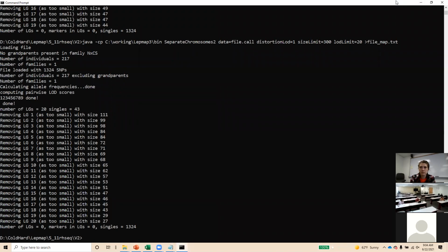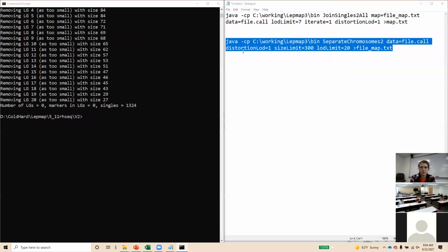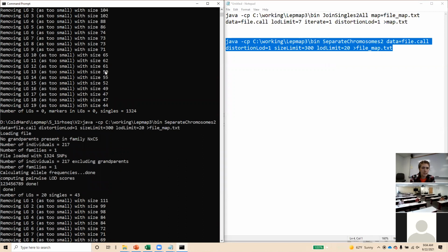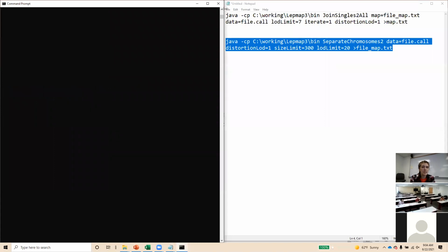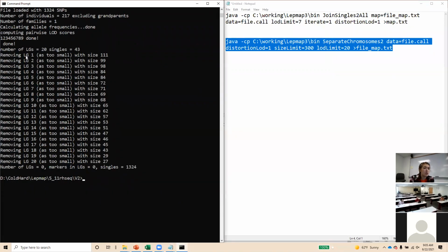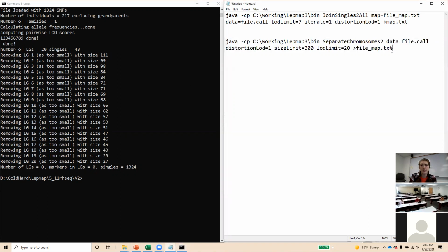Compared to the previous one, if you combine 19 and 20 in this case, that's the 56, right? But then you move a little bit up. No, the previous check, yeah. So see here. Okay, so yeah, it was probably one of the 51s. With this, it's hard to tell sometimes what those numbers actually mean, because this isn't actually chromosome 1, chromosome 2, chromosome 3. It just sorts them from the largest to the smallest. So I would guess this is probably maybe 14 or 18, because those linkage groups are a little bit larger and they generally have a lot of markers compared to some of the smaller ones. These might be chromosomes like 3 or 15 or 5 that generally have fewer markers.